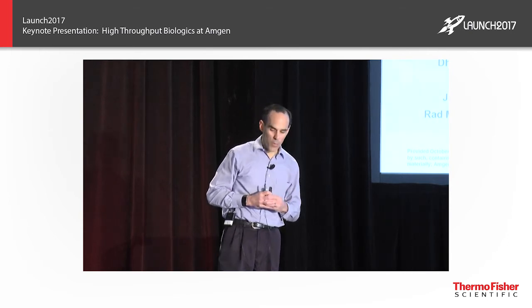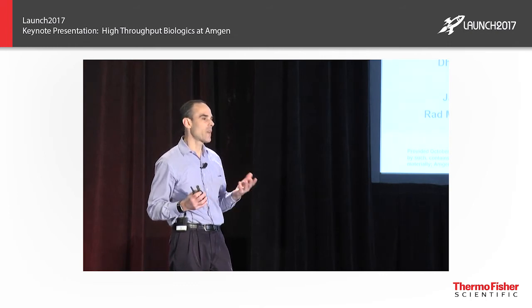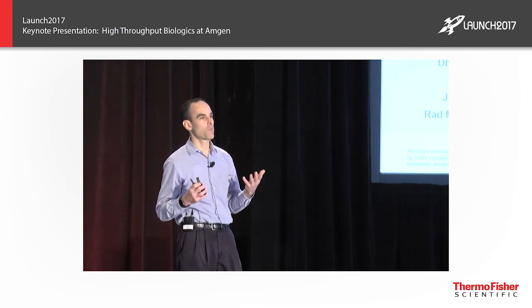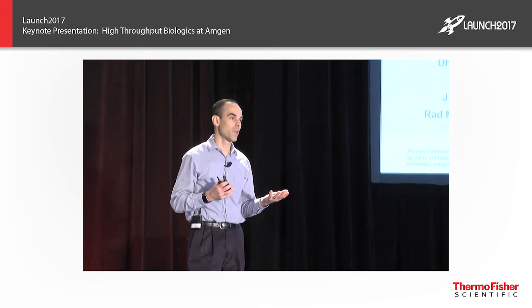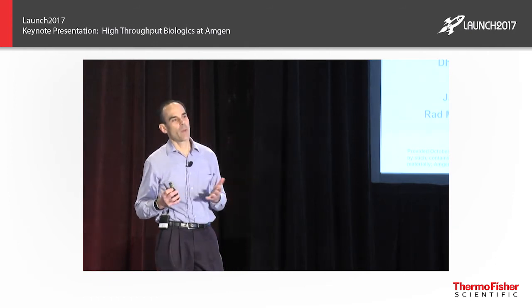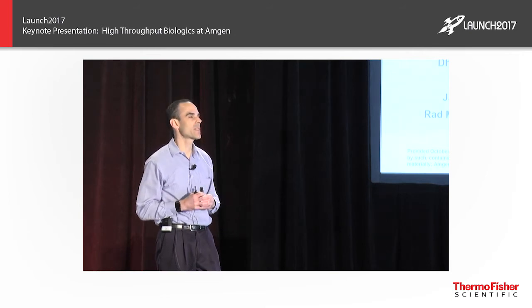Yeah, so we would definitely like to be a lot further along than we are. I consider what we have right now to be a bit of patchwork, in that you have an instrument, you have to develop a custom parser, you have to find ways of trying to automate that upload to make it as painless as possible for the scientists, so it's not too easy. I think Chromeleon helps a lot with the chromatographic data, although again, that's limited to certain types of instruments.